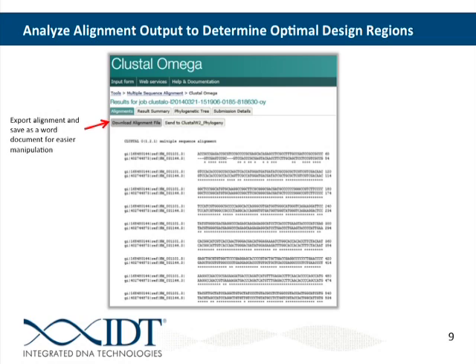And so this can help us if we're trying to design an assay, let's say, for example, that cross-reacts between human and rat, then we can find regions that are highly similar between these 2 and put those into PrimerQuest to design to. Alternatively, if you want a specific assay, you can look for regions where there's differences and design to that. And so that's what we're going to be going through here over the next hour or so. We're going to talk about how to tailor your designs to designing around these specific regions.